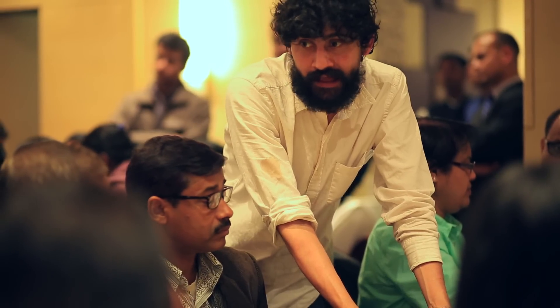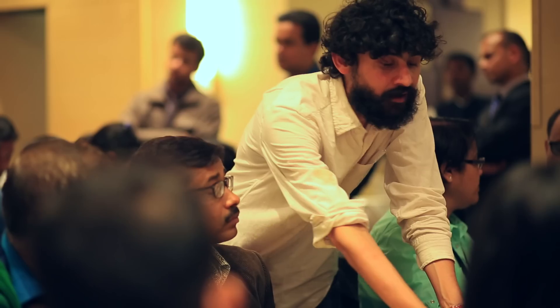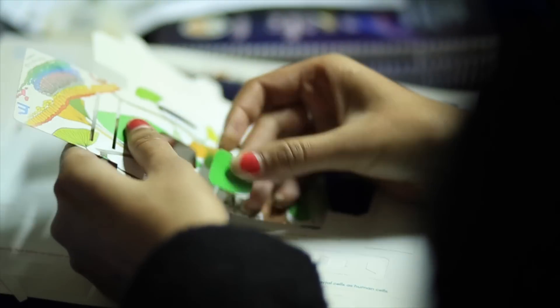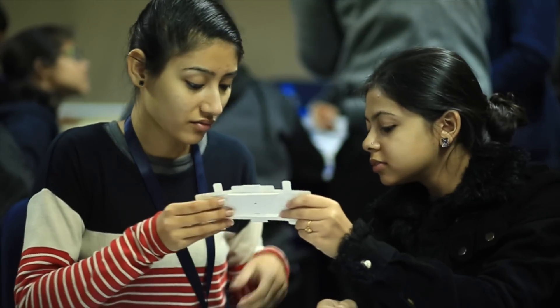Everybody's microscope should work exactly the same way. If it is not working, you just follow the steps back and do it again. It is something that you put together yourself, so hopefully you have the capacity to fix it.